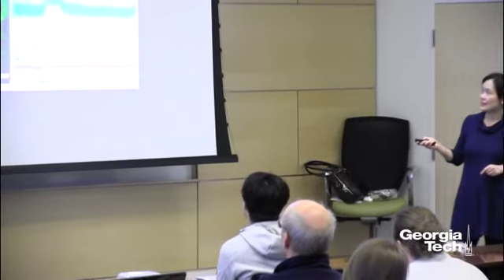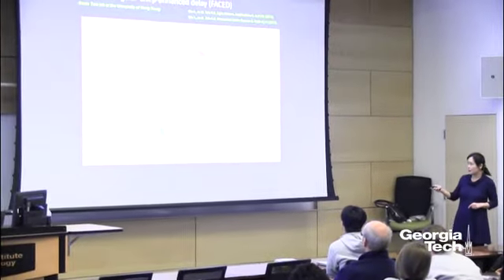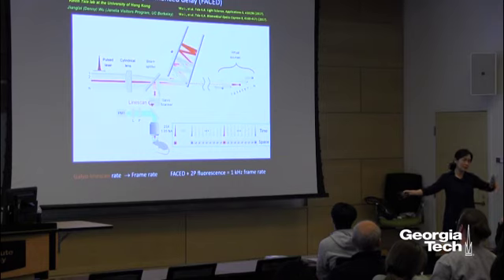Great talk, thank you. Can you tell us about the spatial extent over which you can do this 1 kilohertz imaging? Is there a limit? With the Bessel beam type, it's just 2D. Very good question. In the direction that we're using Galvo to scan, we can scan as large as we want because the Galvo is scanning.